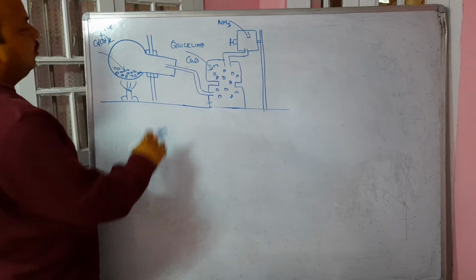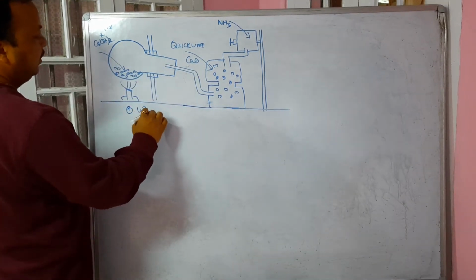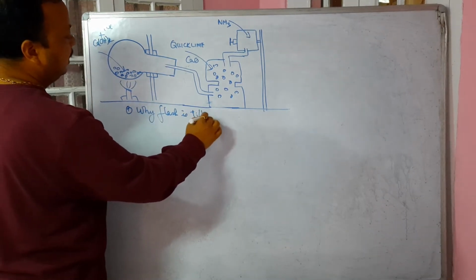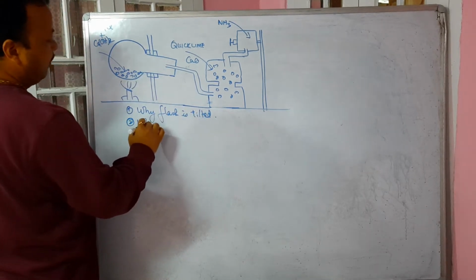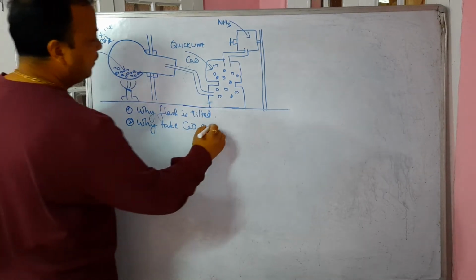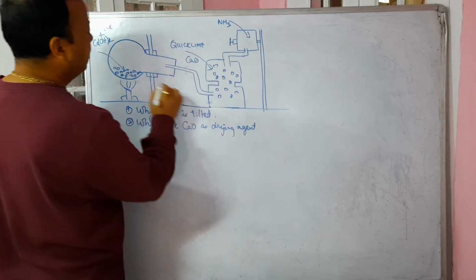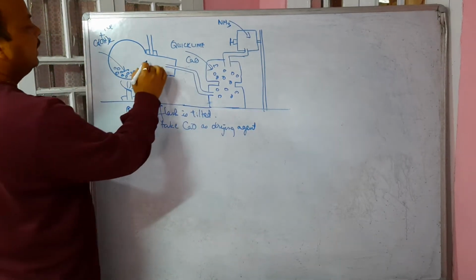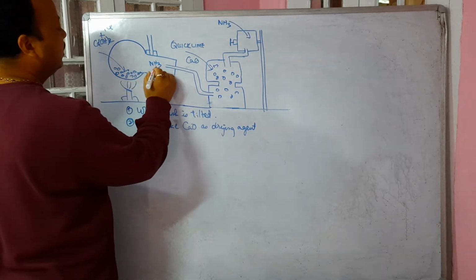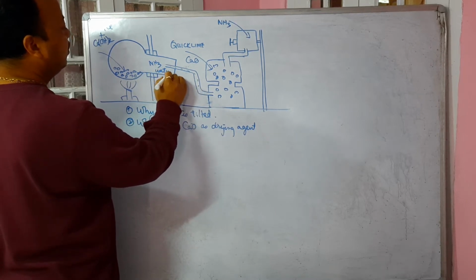Now the questions that come are, first of all, why is the flask tilted, and secondly, why take calcium oxide as a drying agent? Why do we need a drying agent? Because when you heat this, ammonia is going to get produced, but along with ammonia, what will go down here is water vapor.